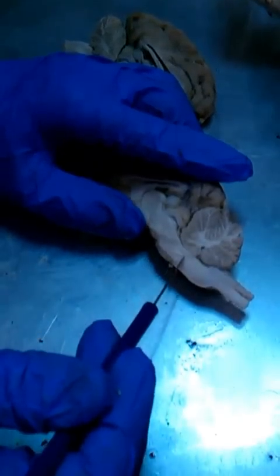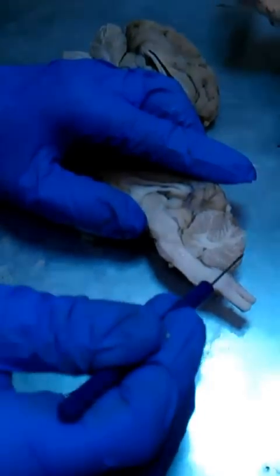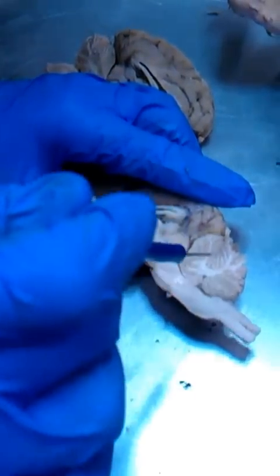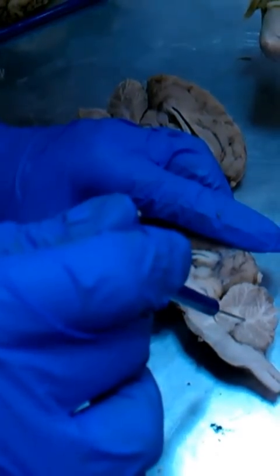We then have brainstem. The whole thing is the cerebellum, and then the white part in the cerebellum looks like a tree. Right there is the arbor vitae.